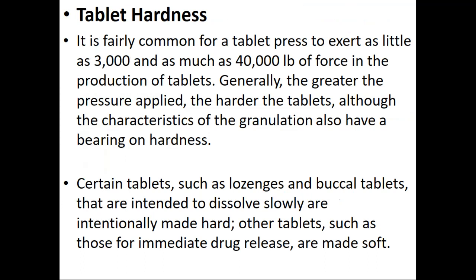Now we have tablet hardness. It is fairly common for a tablet press to exert as little as 3,000 and as much as 40,000 pounds of force in the production of tablets.